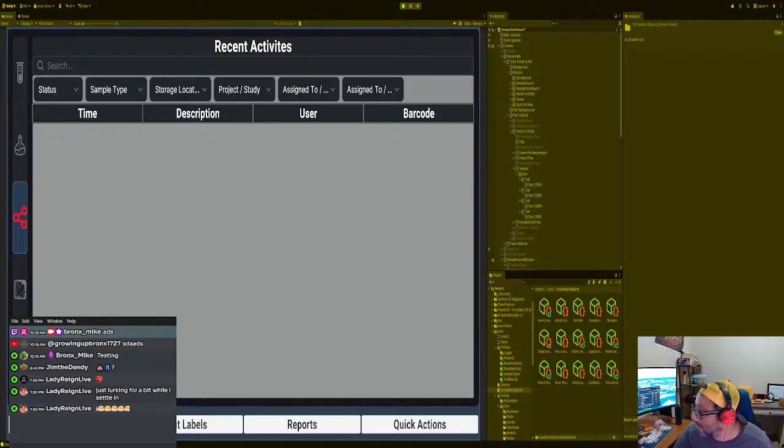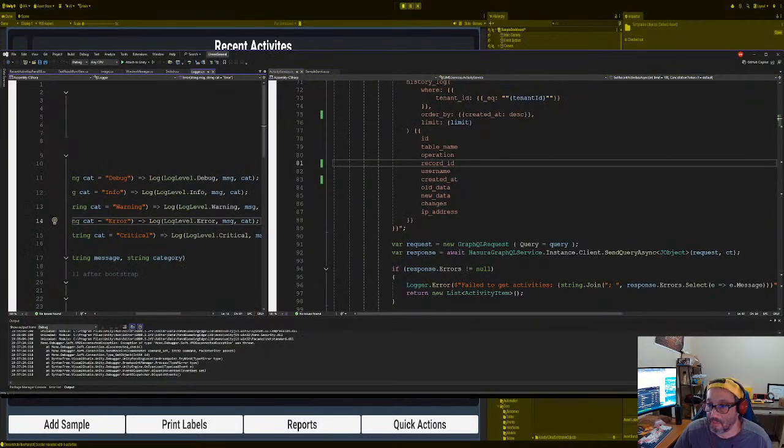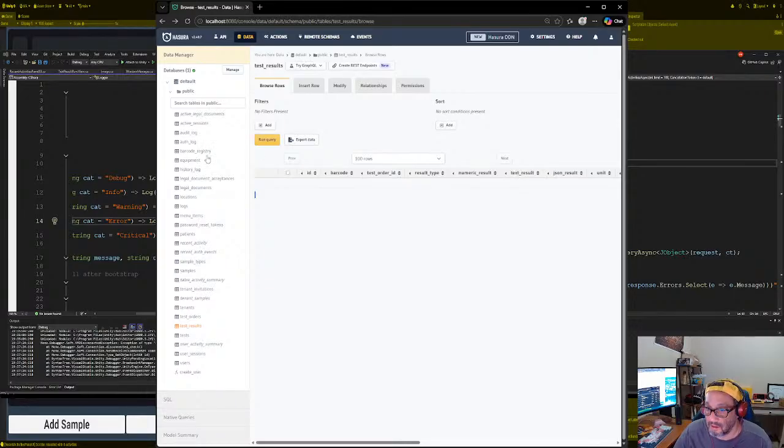All right. Username. What the? Oh God, not this again. There we go. All right, so we got a problem with the history log, which says there is no username. Let me double check on that. History log, history log.